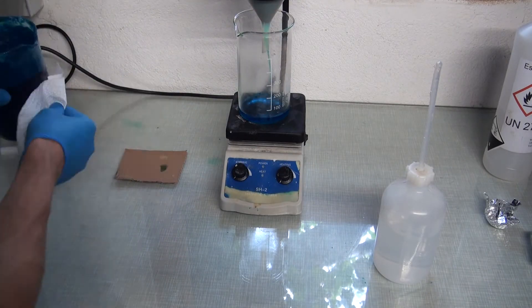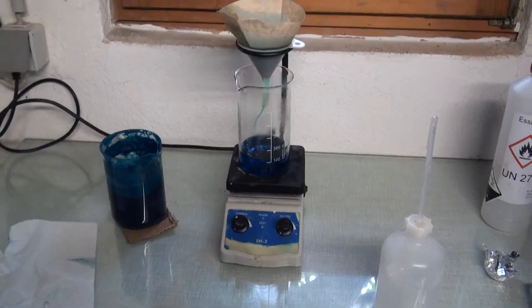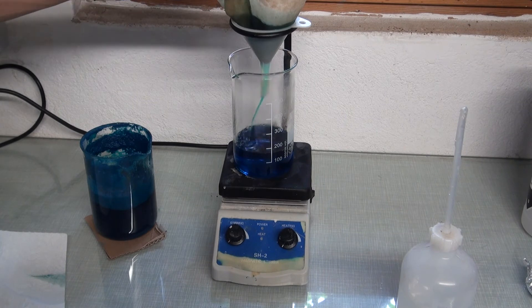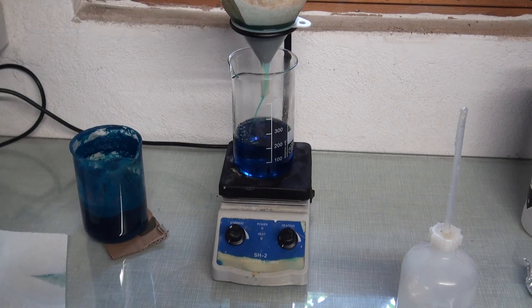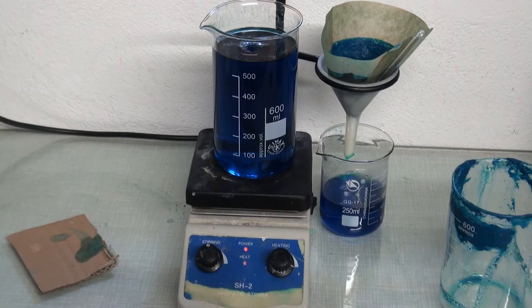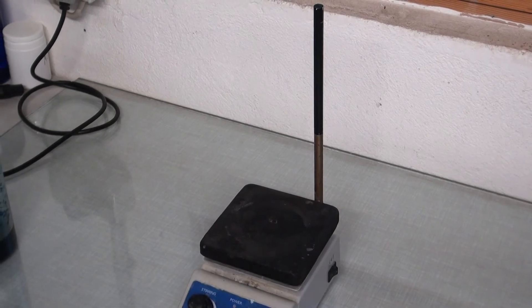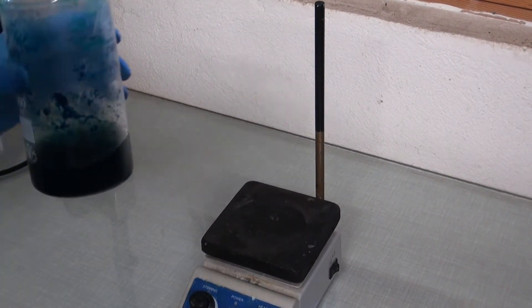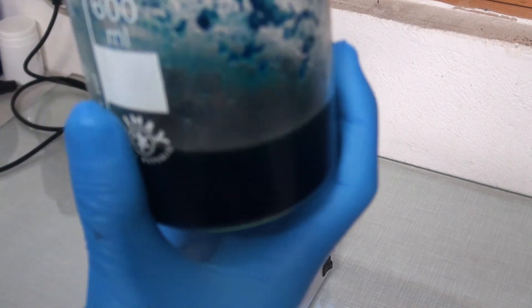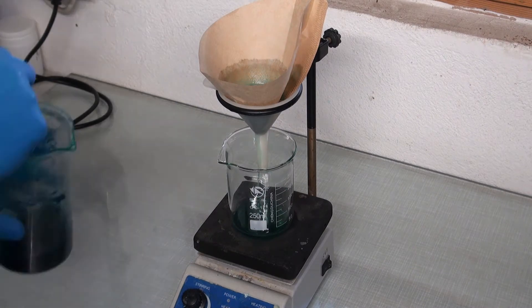Next, everything was filtered. The solution was boiled down to a quarter of the volume. A large amount of product crashed out during that period, and more when I cooled it down.